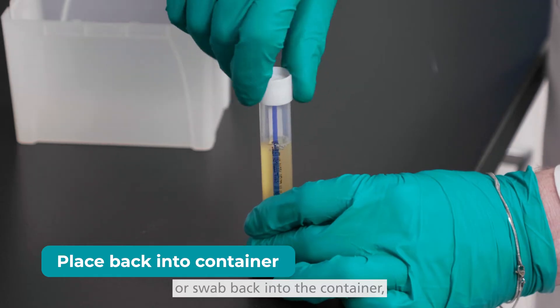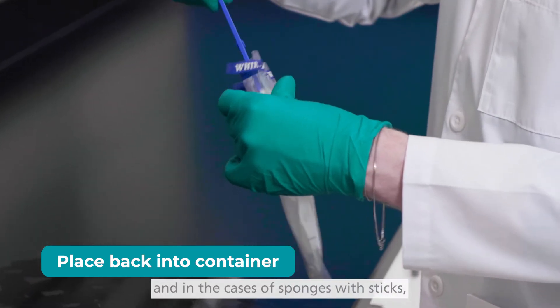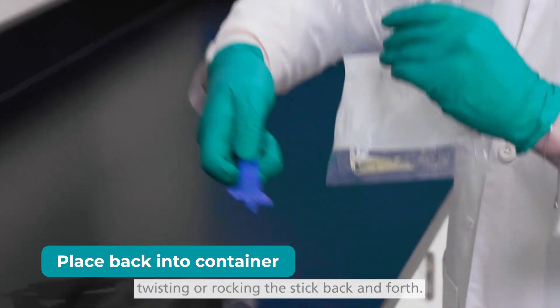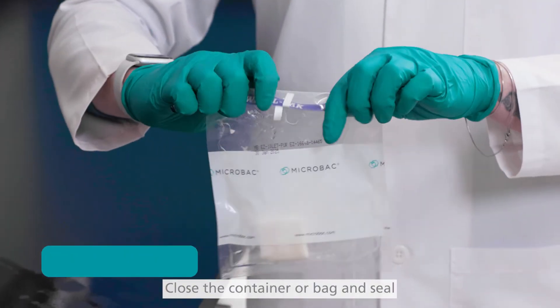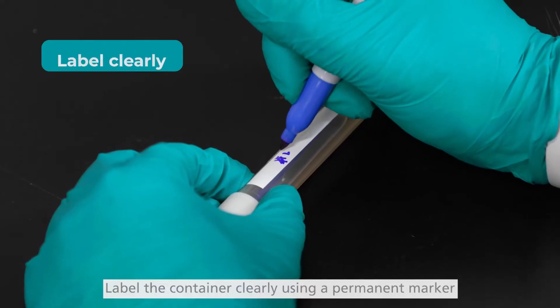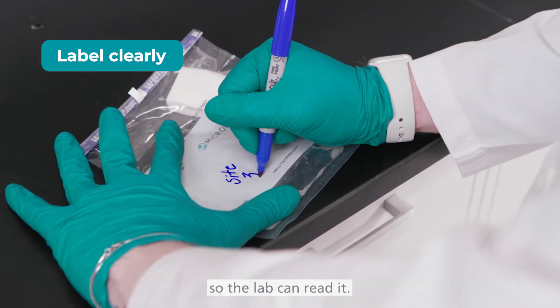Sterily place the sponge or swab back into the container, and in the cases of sponges with sticks, break the stick off by sharply twisting or rocking the stick back and forth. Close the container or bag and seal by rolling down or snapping closed. Label the container clearly using a permanent marker so the lab can read it.